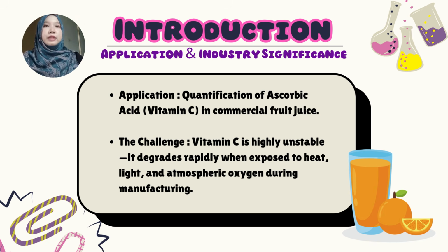Next, the practical application here is the quantification of vitamin C in commercial fruit juices. This comes with a challenge. Vitamin C is highly unstable and degrades rapidly when exposed to heat, light, and atmospheric oxygen during manufacturing.